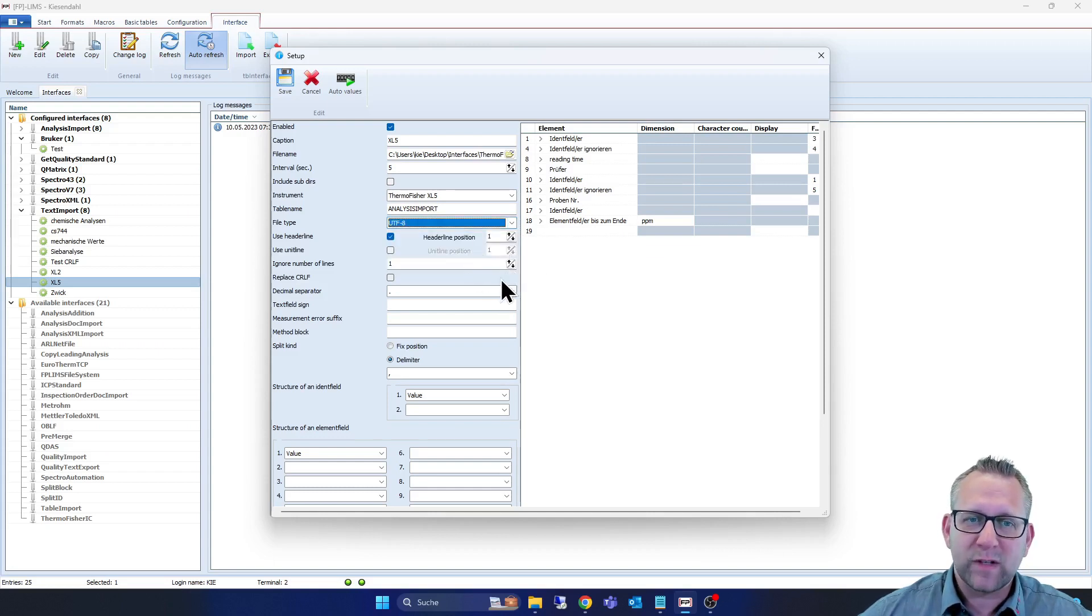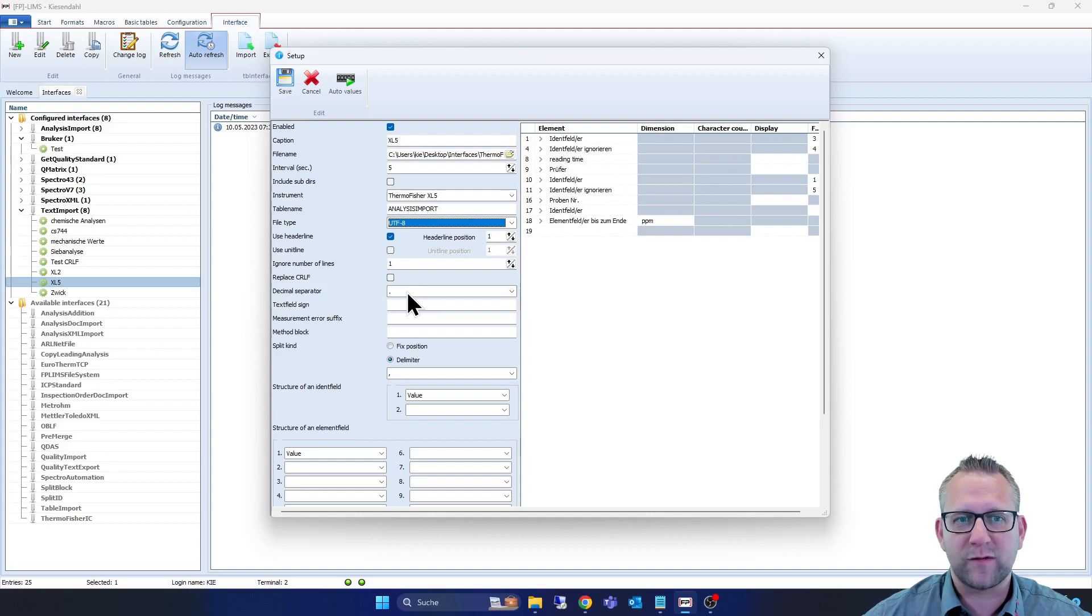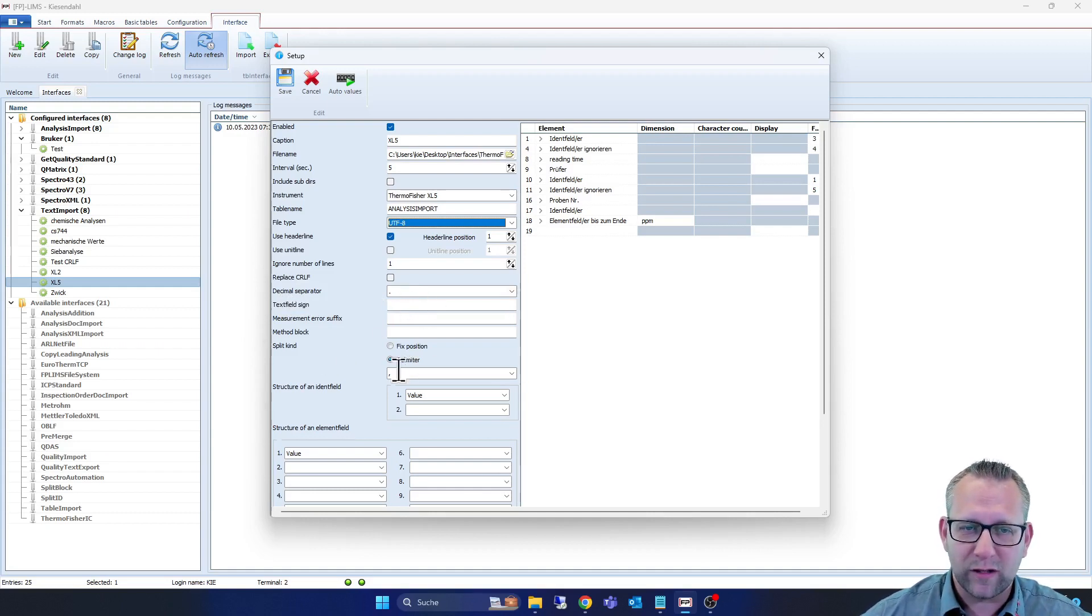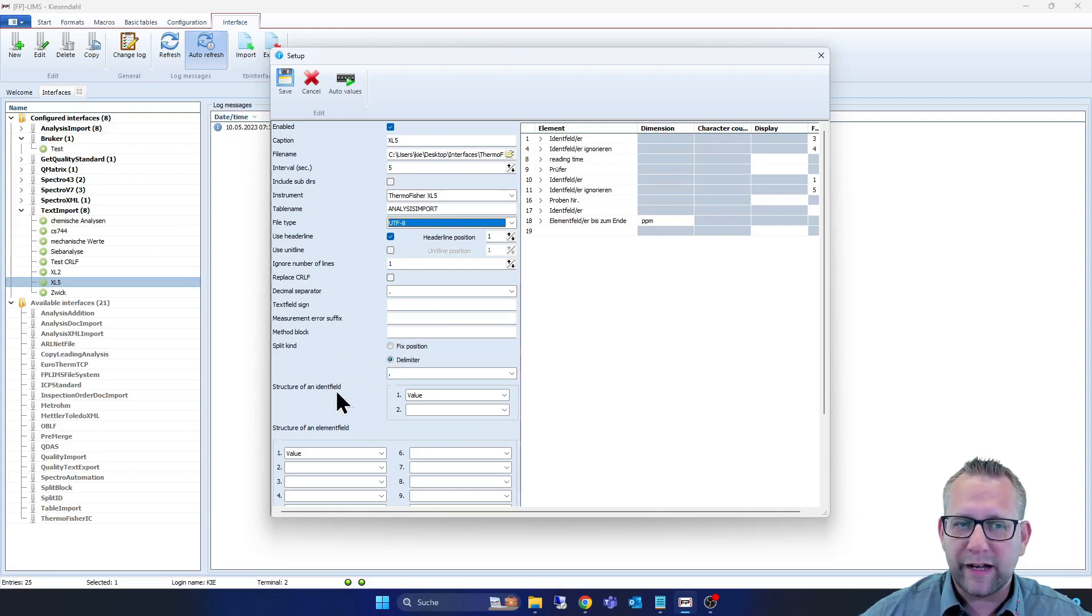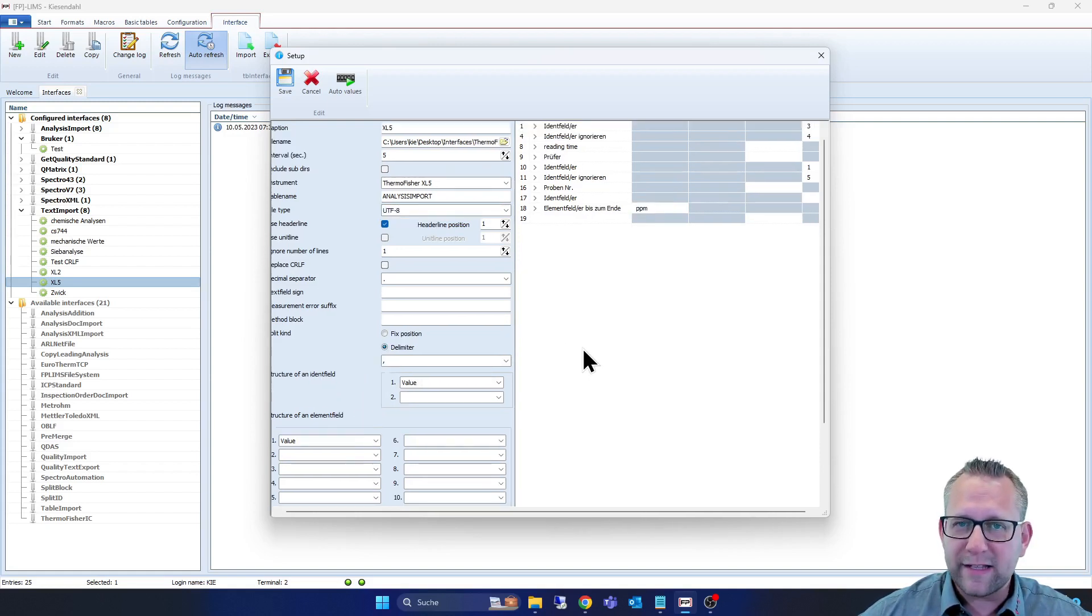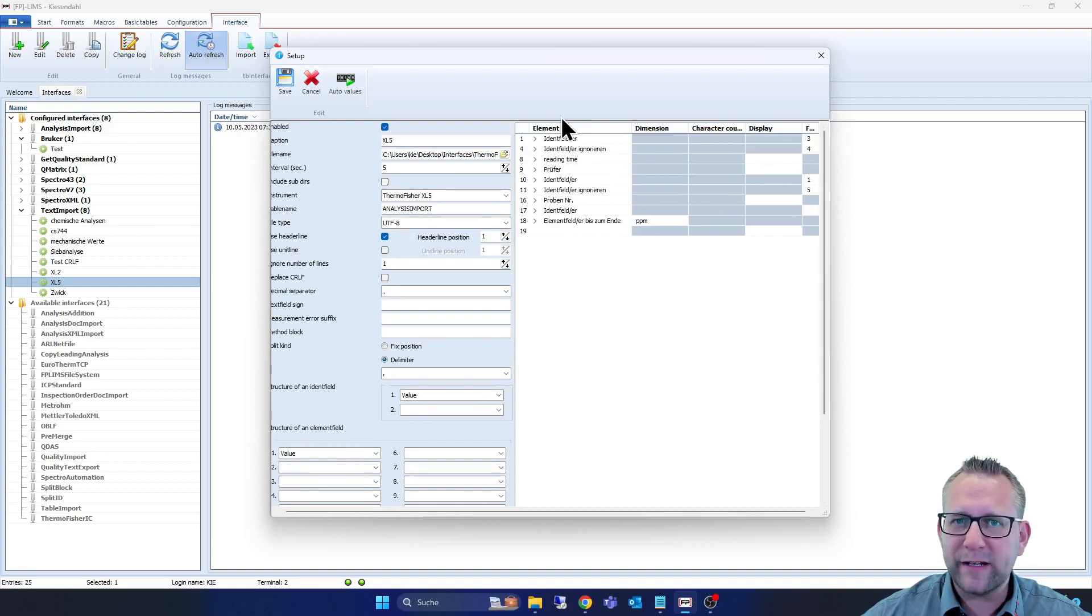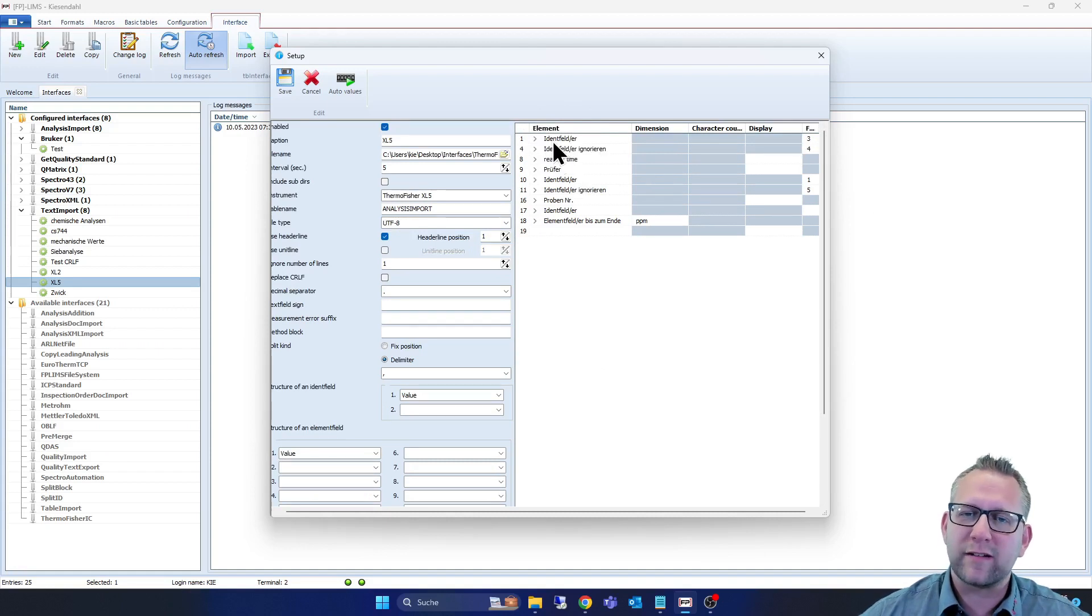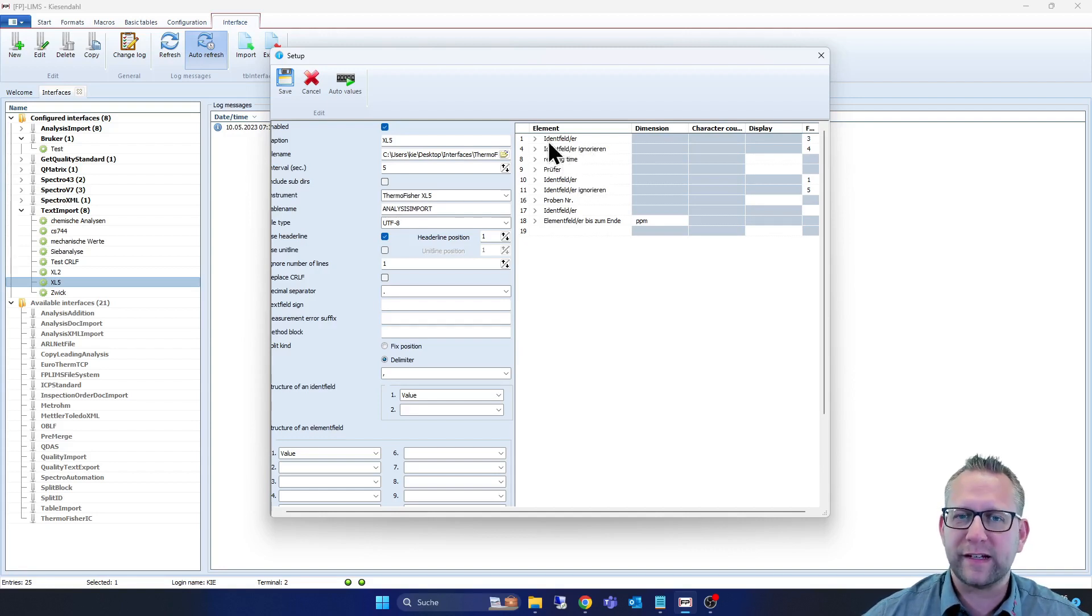So then we see here the decimal separator. We see it in the structure of the CSV file, it is a dot. And if we take a look down, we see here the split kind. This is a delimiter, is a comma. And the direct structure of the identification field is on the right side. We see here the element, and we take a look at the element structure and at the structure of the same CSV file, and we pick it one-to-one into our FP-LIMS to read it in automatically.